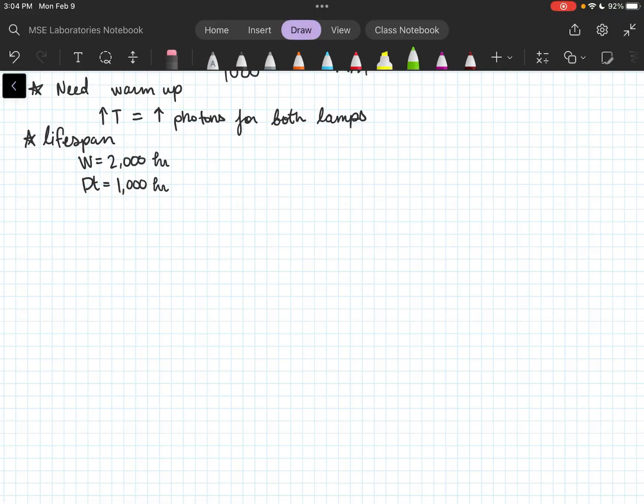There is also, from manufacturer to manufacturer, a couple different ways that the UV-Vis-NIR instrument can work. And what it comes down to is how we move the light from the lamps to the sample. In our instrument and in other good quality instruments, you're going to have both lamps and some way to swap between the lamps.